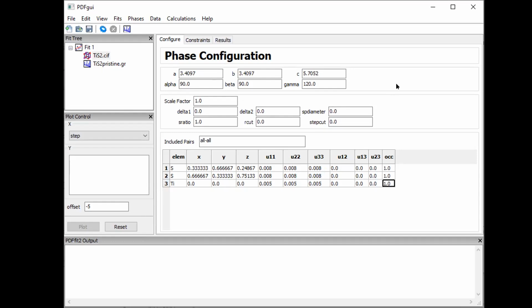And when we talk about the landscape of these fitted parameters, how the fit improves depends on those parameters in different ways.